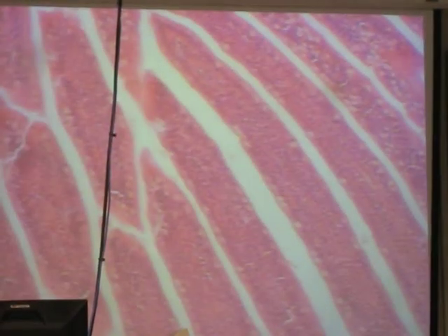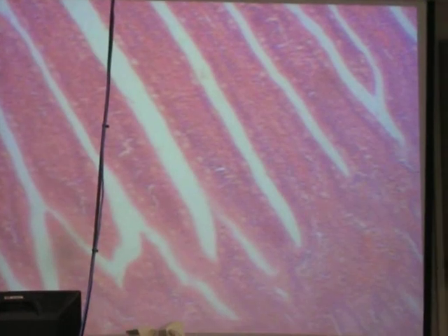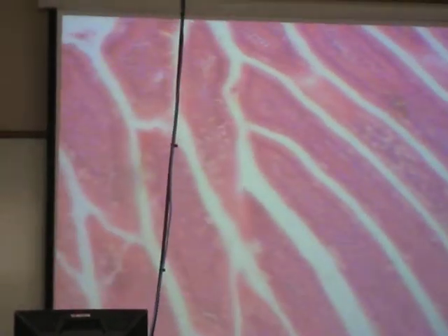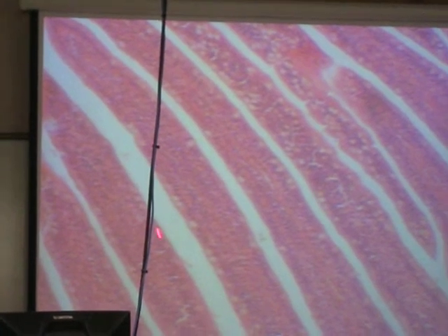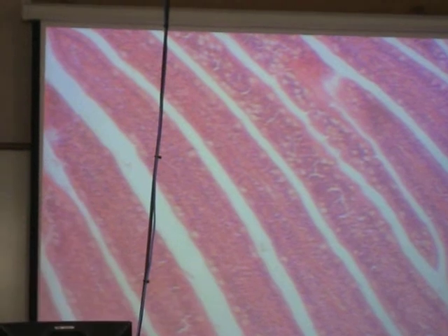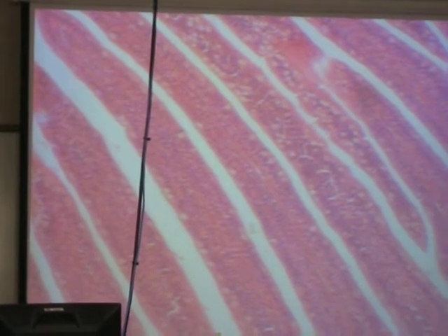Going to the middle section is typically your jejunum, which you'll notice that the very elongated, much more pronounced, much more elongated villi. The length of these villi, compare those to your duodenum as well as your ileum. That's one of the key features. And then also you'll see a more concentrated network of goblet cells. So as you move along the intestinal tract, you get more and more goblet cells. Okay, and that's the jejunum.